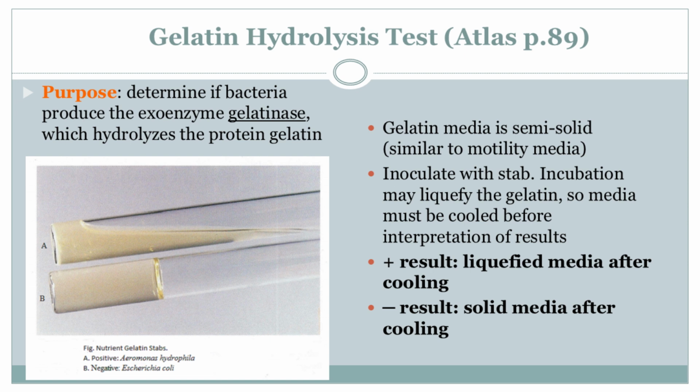Okay, so we've got our gelatin, we've got our microscopic suspects. Now what? How does this test actually work? Scientists make a special gelatin medium. Think of it like a buffet for bacteria. They put a sample of bacteria into this medium and let it sit for a day or two, giving those bacteria plenty of time to chow down at the gelatin buffet.